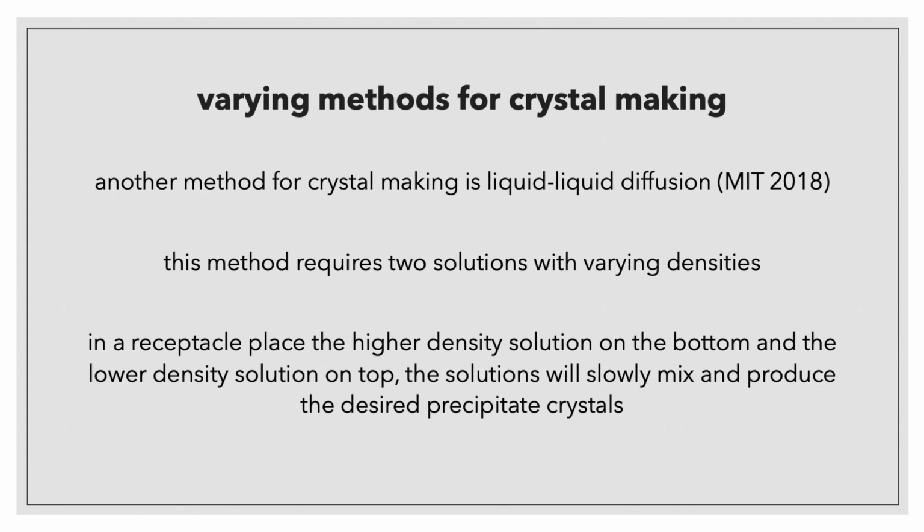A drawback to this method is that there are few solution combinations that can successfully produce crystals through liquid-liquid diffusion.